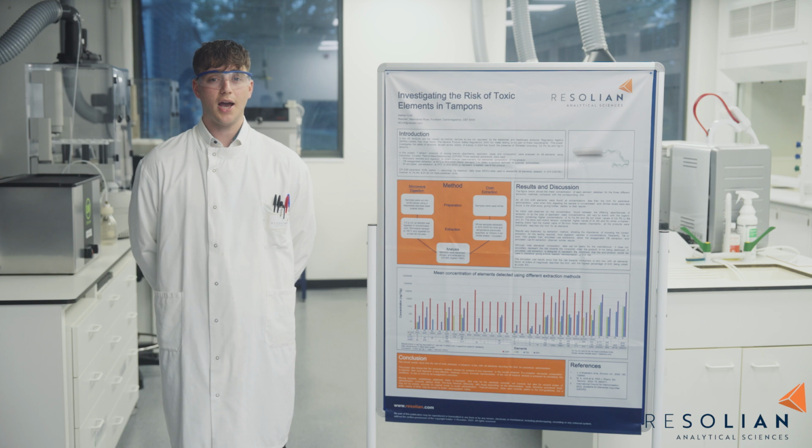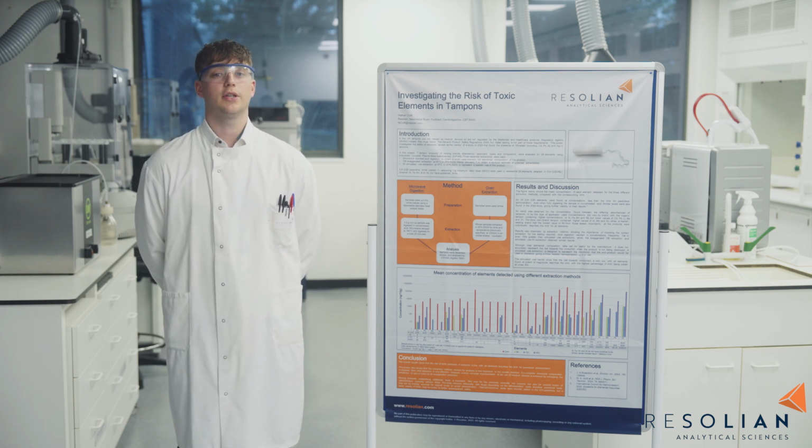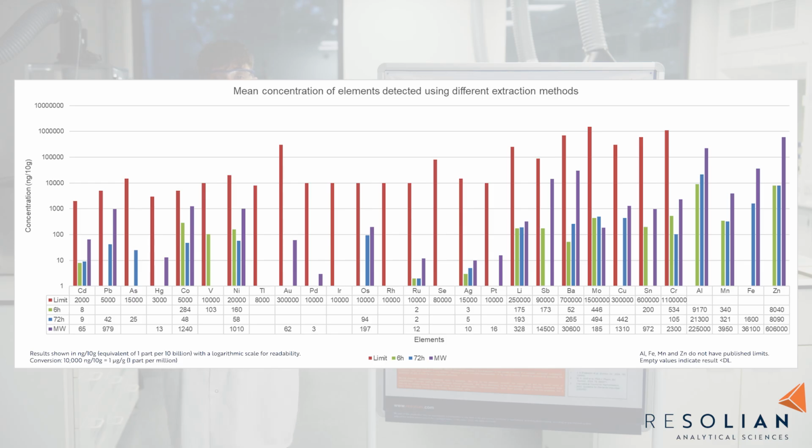the sample. However, results vary drastically by extraction method, showing the importance of choosing the correct extraction for the testing required. Acid digestion resulted in concentrations frequently 10 times or even 100 times greater than simulated use extractions, whilst the exaggerated and simulated use extractions obtained similar results.